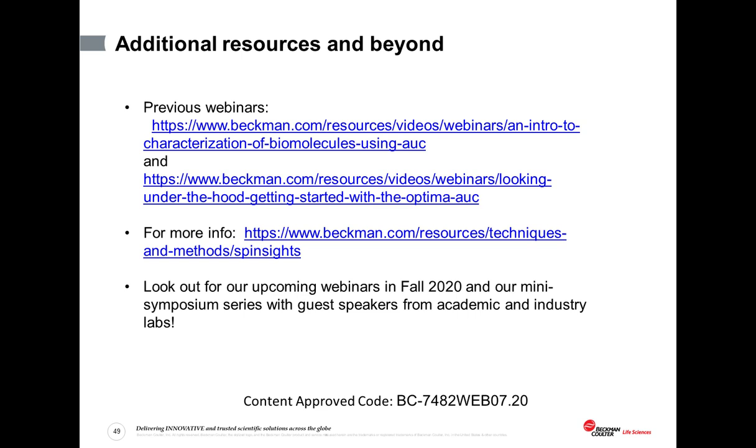Okay, perfect. Another question is a little bit more of a situational example. This person says, I'm trying to set up a binding isotherm series of experiments to determine KD for my protein, but I'm not able to reach the low concentration range that I need because there's not enough signal. What can I do? Okay, excellent question. If you're doing a proper binding isotherm, you at least need to be one order of magnitude above and one order below the KD, otherwise your binding isotherm on the logarithmic scale just won't look like a proper S-shaped curve, and results won't be reliable.